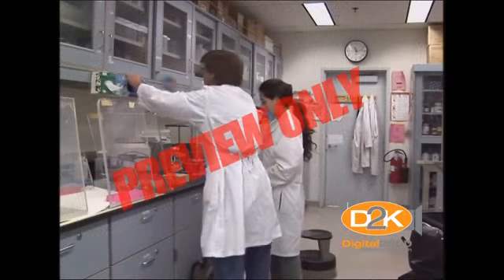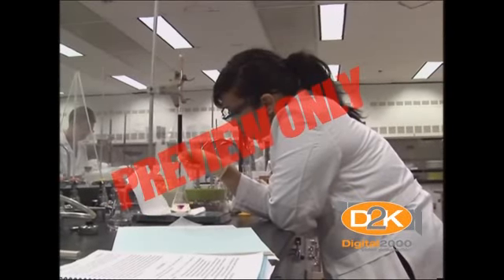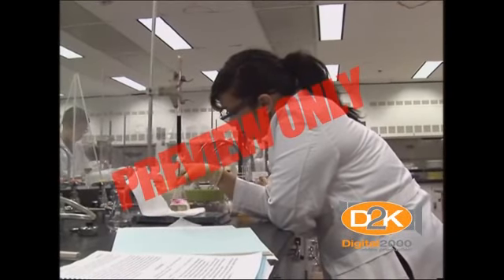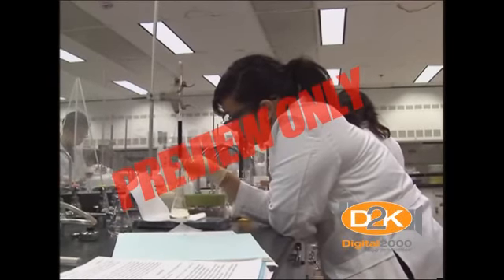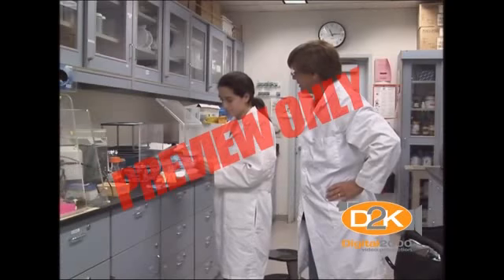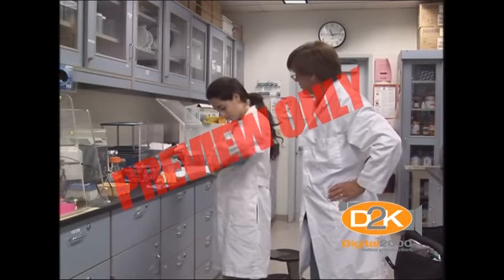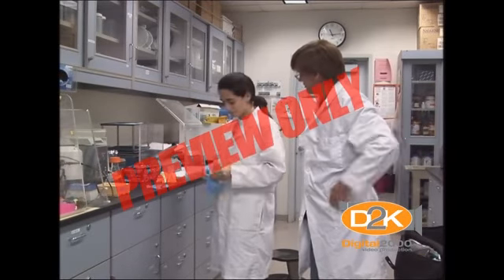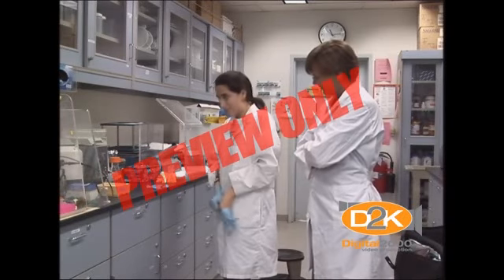First, you should consult with your professor or EHIS office. Consider using powder-free gloves, which may help reduce your irritation. Neoprene gloves have been shown to cause less irritation. Neoprene is resistant to most organic and inorganic acids, bases, solvents, oils, and alcohols. This may be a workable alternative.